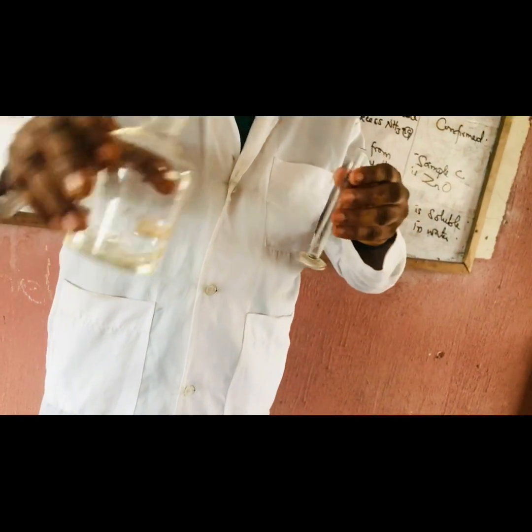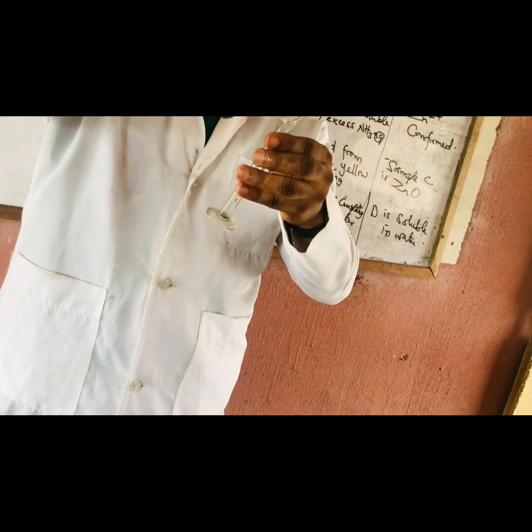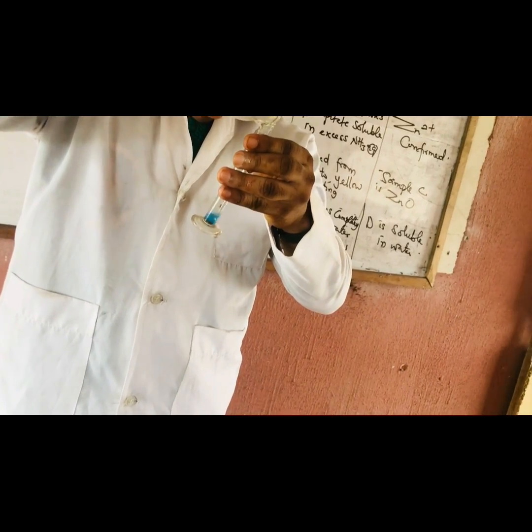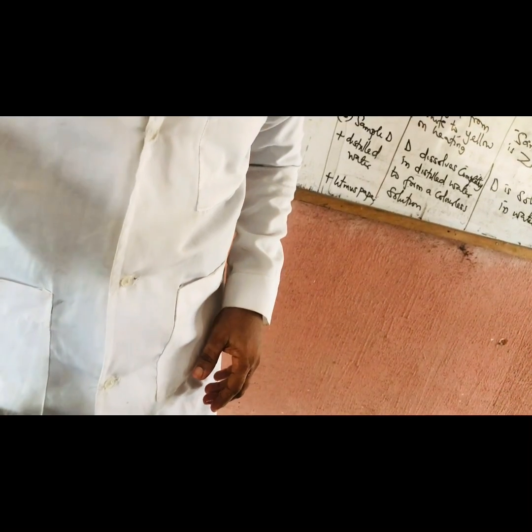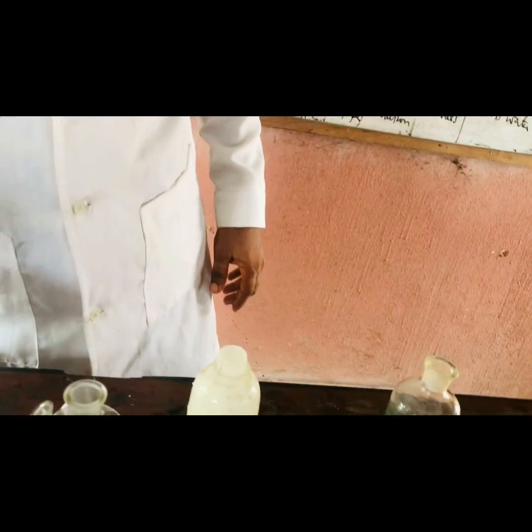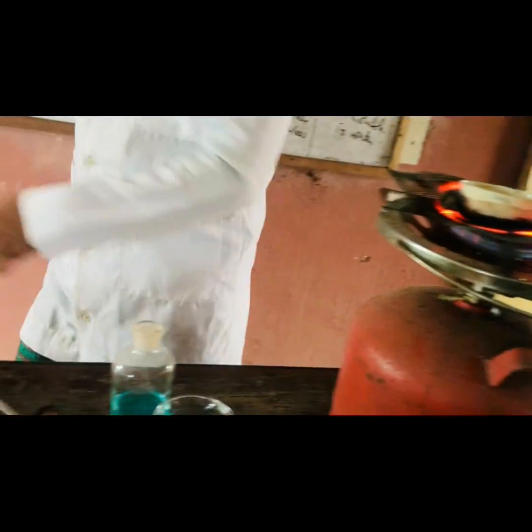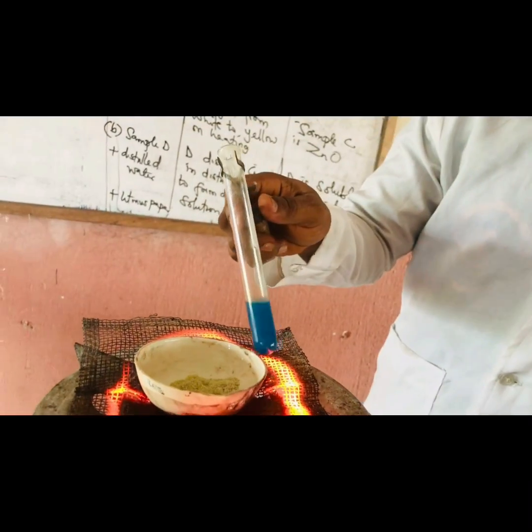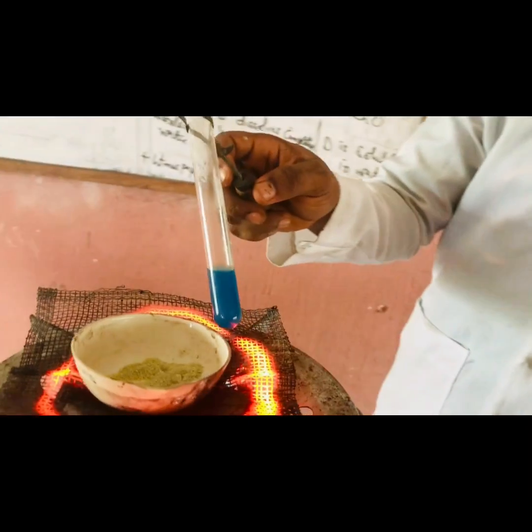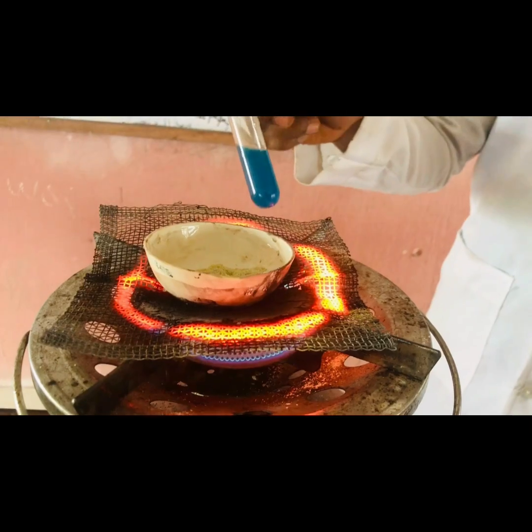So it's Fehling's solution B. That's it. Okay, so to heat gently.